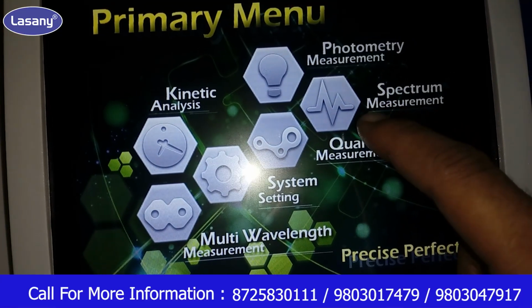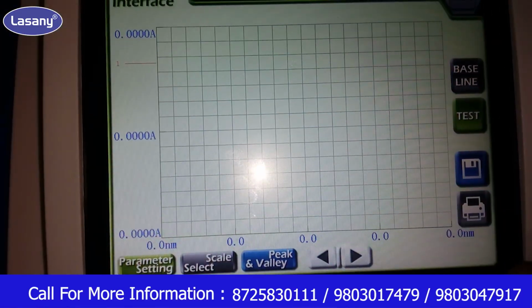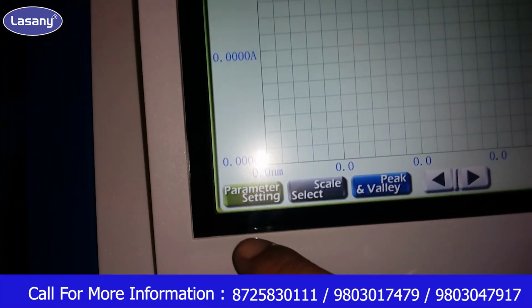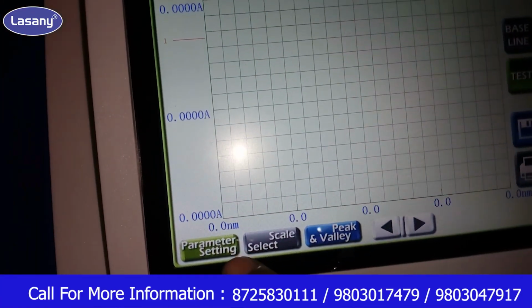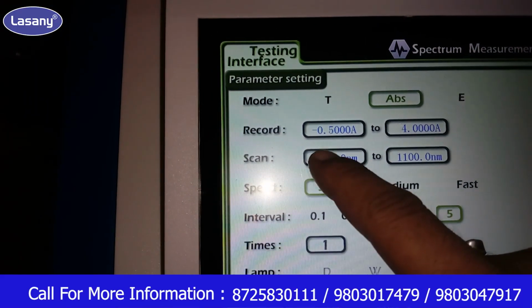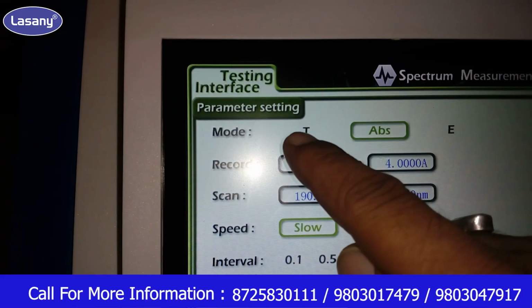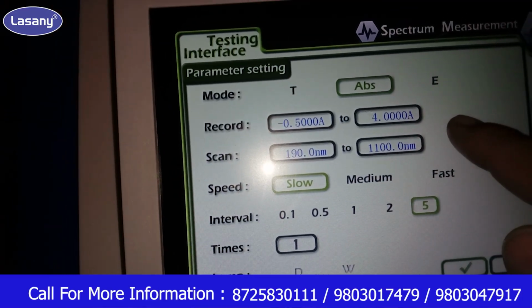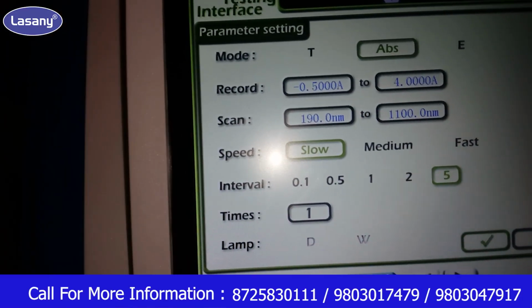After that, the next mode is spectrum measurement. This is our wavelength scan mode. First of all, we have to do a parameter setting. Input your testing mode: transmittance, absorbance or energy, whichever curve you want to see.